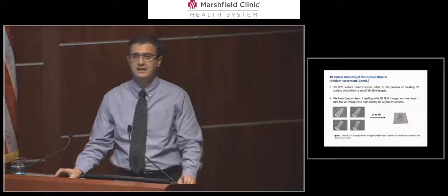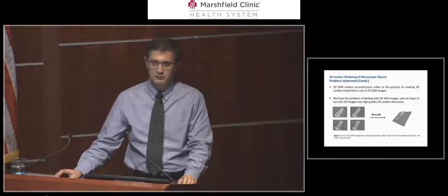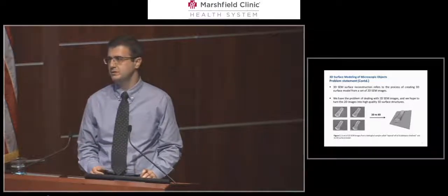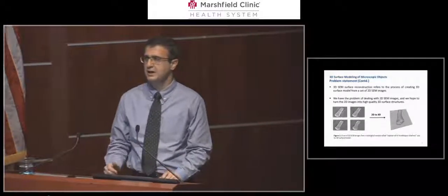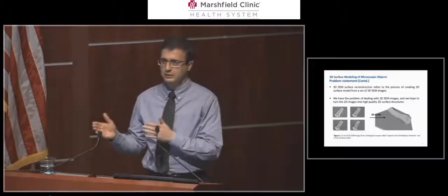What do we mean by 3D SEM surface reconstruction? When you take a photo from a real microscopic sample, you actually convert all 3D points on that scene into 2D points in an image plane. By 3D SEM surface reconstruction, we tackle the inverse problem, going from 2D to 3D.